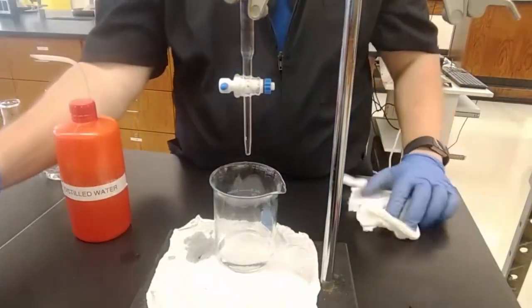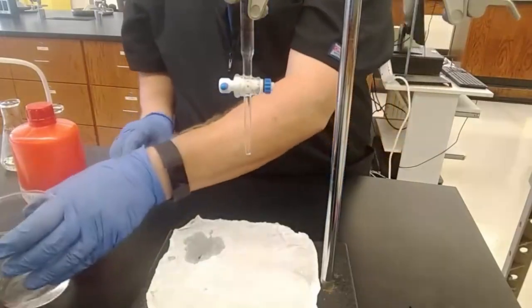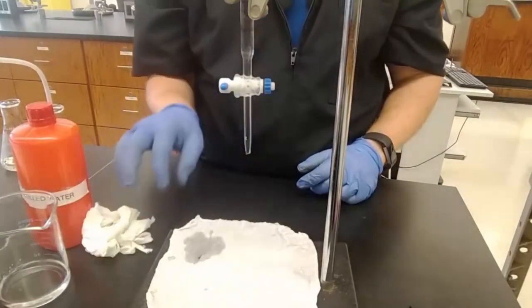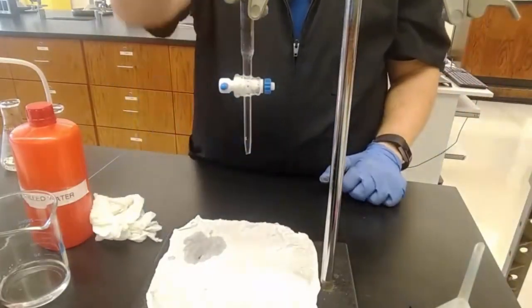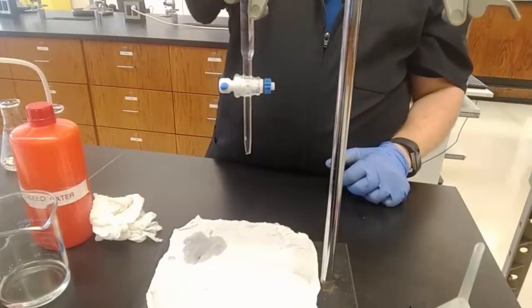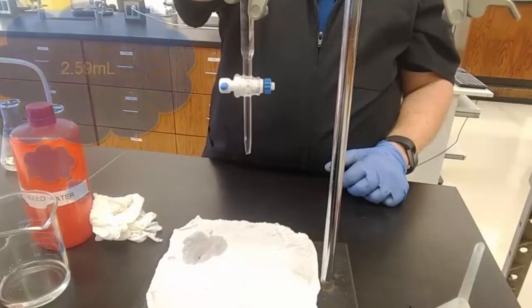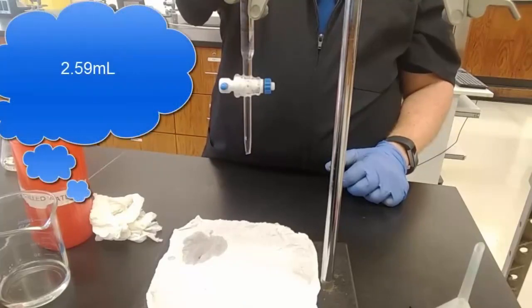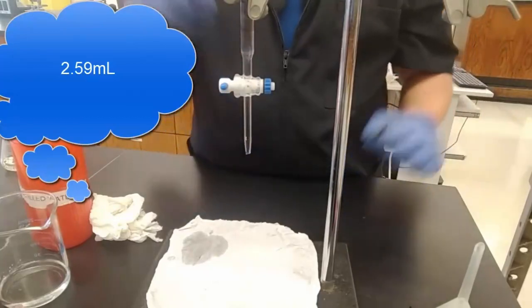So here we go. I need my initial value as I'm starting here. So, I don't have to worry about my tip. It's still good from last time. Taking out my funnel, as always. And I'm going to get my initial reading, which is between 2.5 and 2.6, 2.59. Yeah, 2.59 is my starting value the second time around.